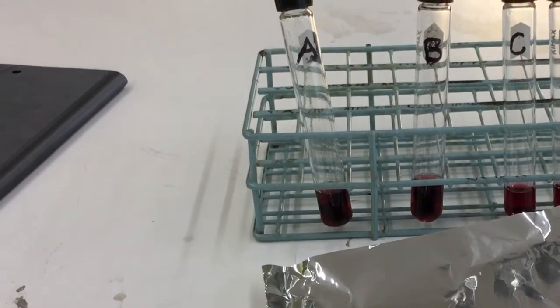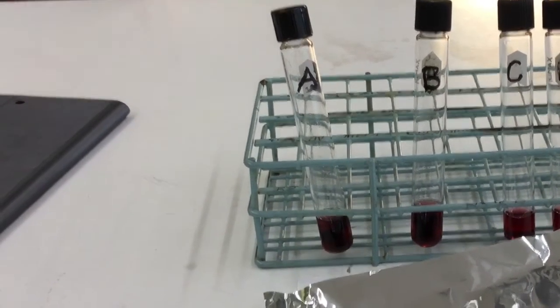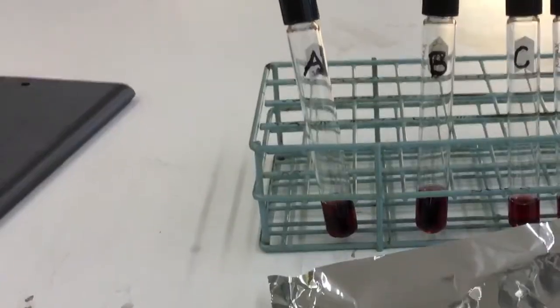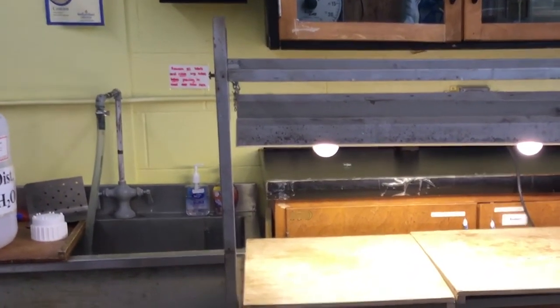When all the tubes are ready, I'll then put them in a light bank, like this one here, making sure the tubes are all at an angle so that they have the most exposure to light as possible, most surface area exposed to light.